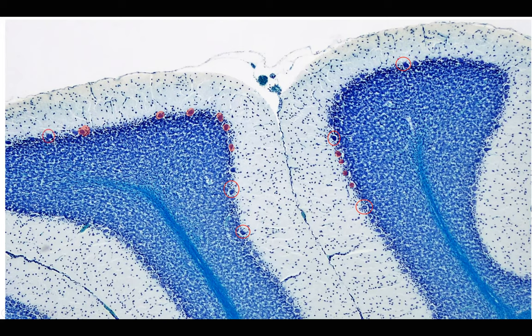Those cells are neurons — more specifically, they are our Purkinje cells. We're going down the list, and my goal isn't to be tricky. You should have the answers right in front of you on your histology list. The Purkinje cells are found in one place and one place only. As we look at nervous tissue, remember: three things are related — location, structural classification, and functional classification.